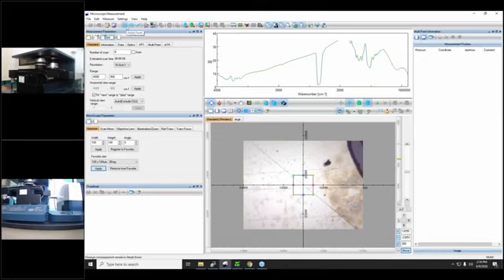The 3 are multi-point, lattice, and line. Those are the ranges that we can choose to make the measurements. And the other buttons that I'm going to be talking about and using today are the monitor background, sample, monitor sample, and actually here background measurement and sample measurement.